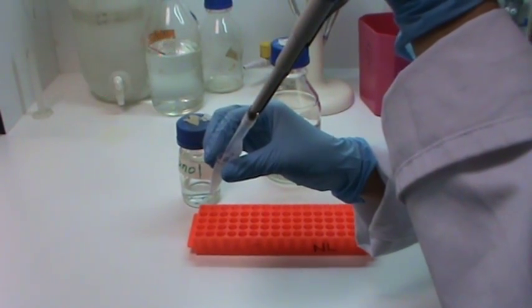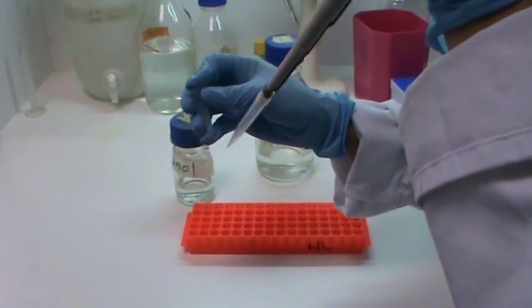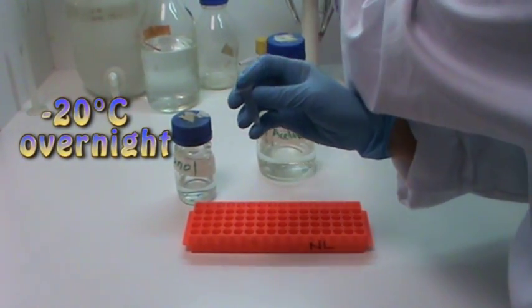I will then place the microfuge tube in the freezer overnight, which is at minus 20 degrees Celsius. This will help in the precipitation of the DNA.